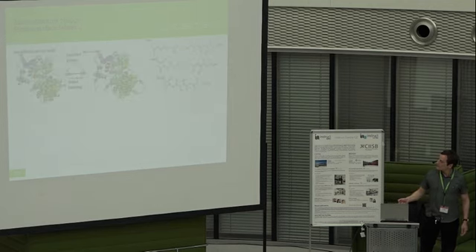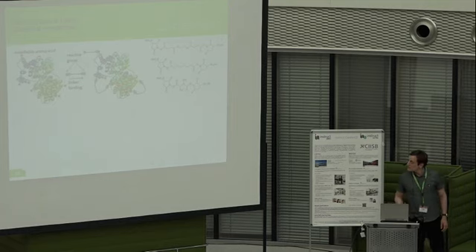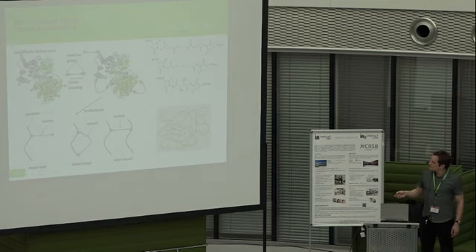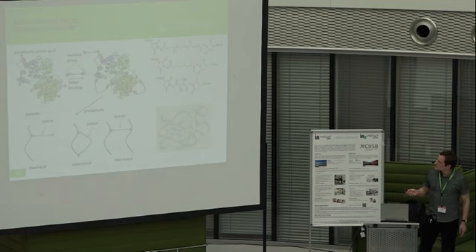And the first method I would like to mention, I think you heard about it frequently at conferences or elsewhere, is protein chemical cross-linking. By some bifunctional reagents, you can connect reactive groups within the protein with a linker that has a distinct length, and in correlation with other structural studies, it can give you information about the distance of the amino acids which were subjected to reaction of this linker.